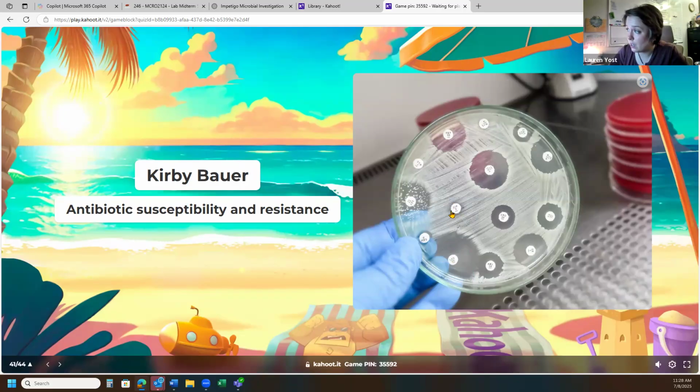It's just that this is the only place where it is even remotely effective, and it's not very effective for this guy. So that's the idea. There's still antibiotic even out here where there's growth. It's just you need at least this much of a concentration for it to inhibit the growth. The further out you get, the less of that antibiotic there is. And so the closer you are, the more of that antibiotic it takes to be inhibiting growth.